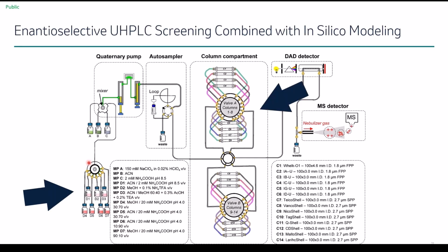They tend to be more familiar with LC techniques. Therefore, we decided to establish a chiral HPLC tool in order to efficiently come up with chiral methods that can compete with chiral supercritical chromatography, while having a more user-friendly feature.